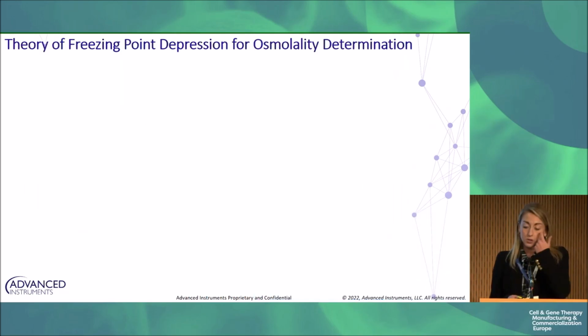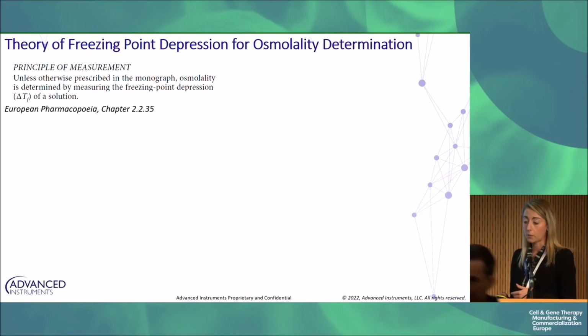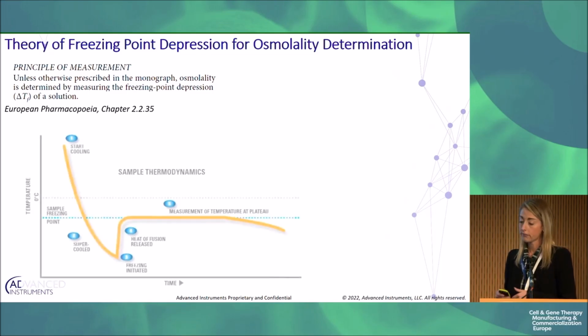Moving on to the technology within the instrumentation. First of all, I wanted to show this from the European Pharmacopoeia. For osmolality testing, the European Pharmacopoeia directly states that freezing point depression should be the technology used. And what is freezing point depression?